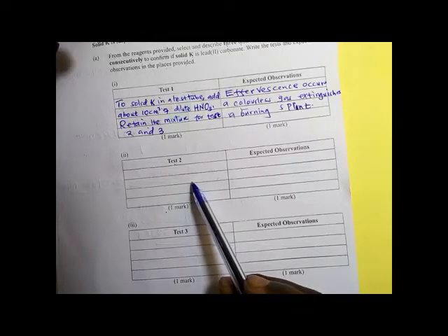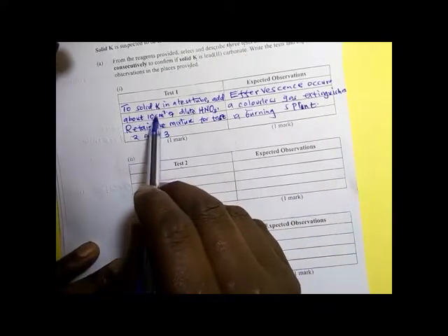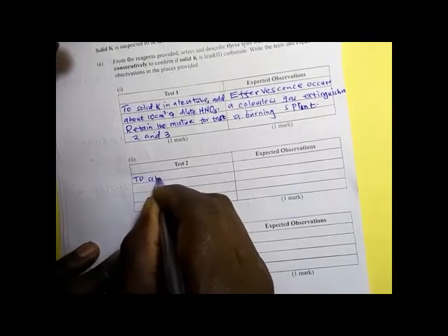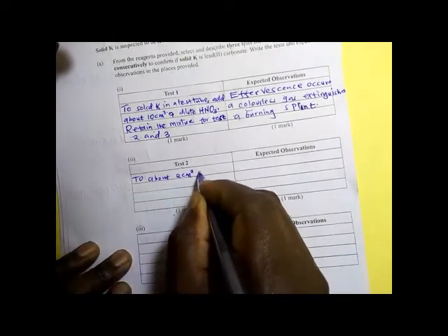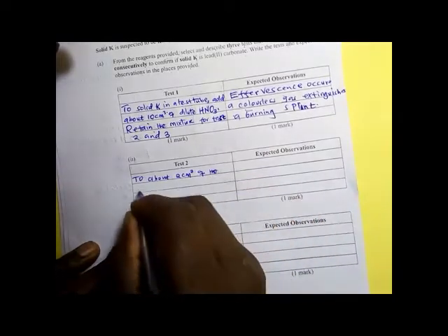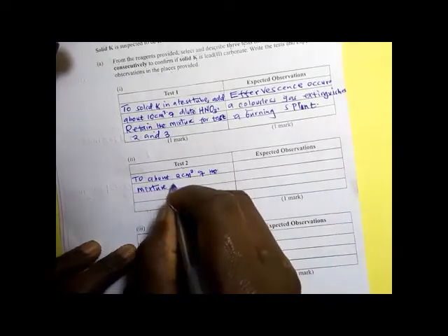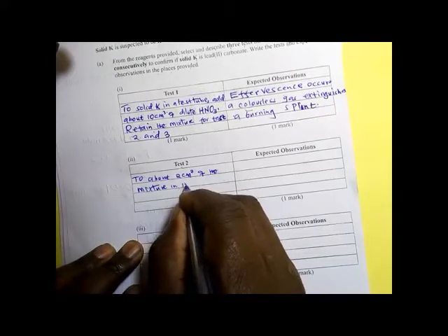Therefore, we now take about 2 centimeters cube of the mixture in 1 above.